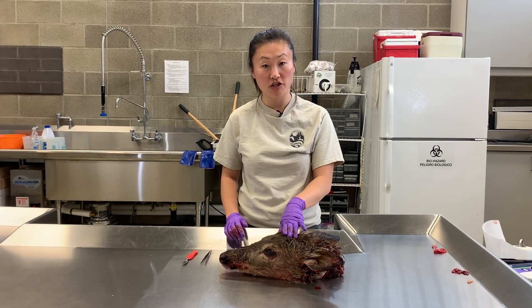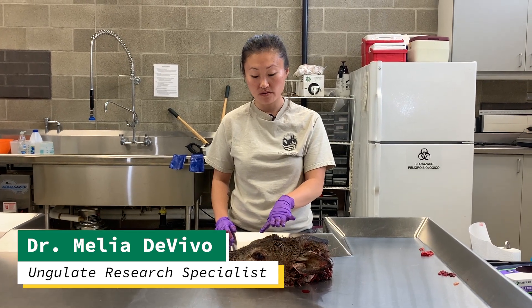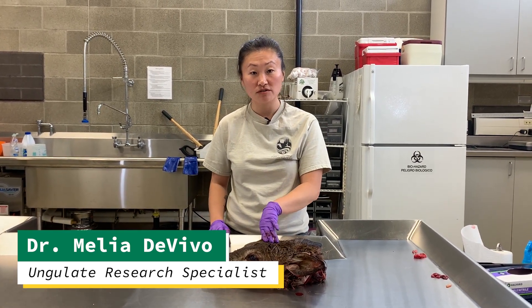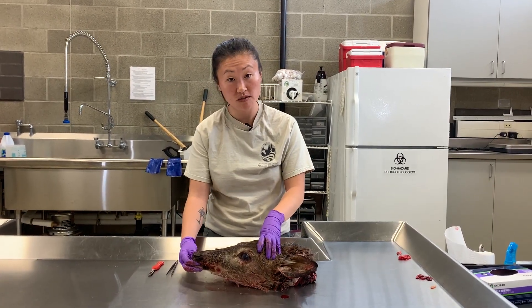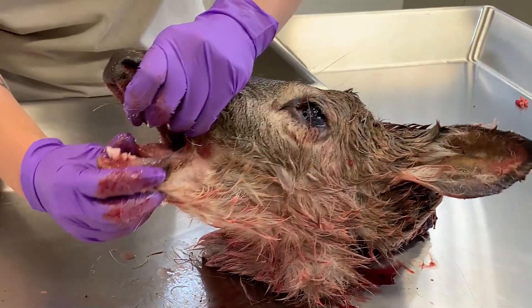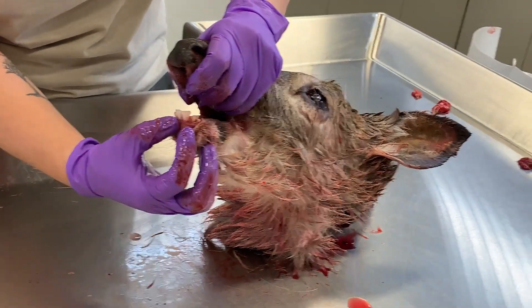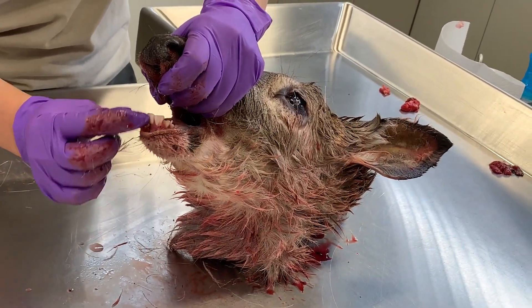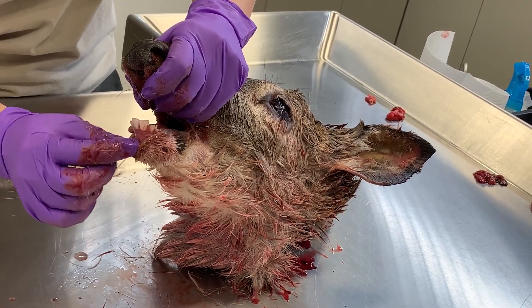Now I'm going to show how to extract the incisors — the front two teeth — and we use teeth to age deer and elk. To collect the front two incisors, it's real simple. All you need is your hunting knife. These are the front two incisors, and we use the root — the part of the tooth that's hidden by the gums — to age them.